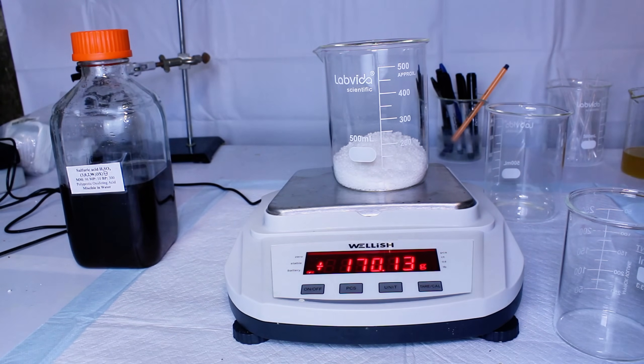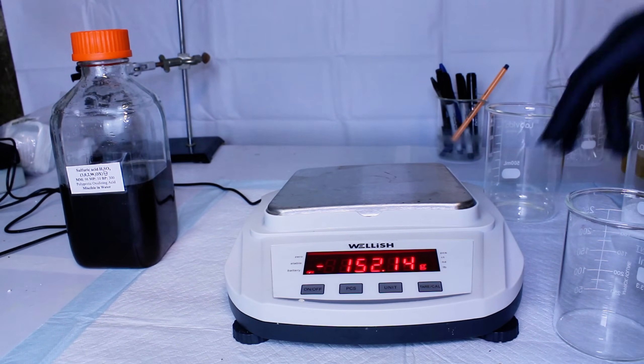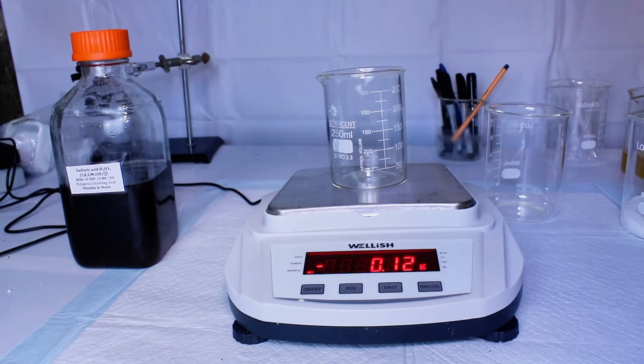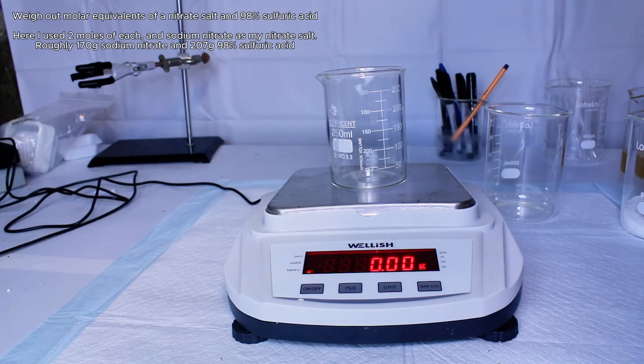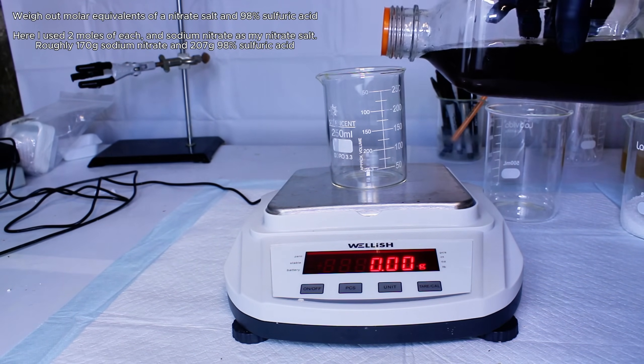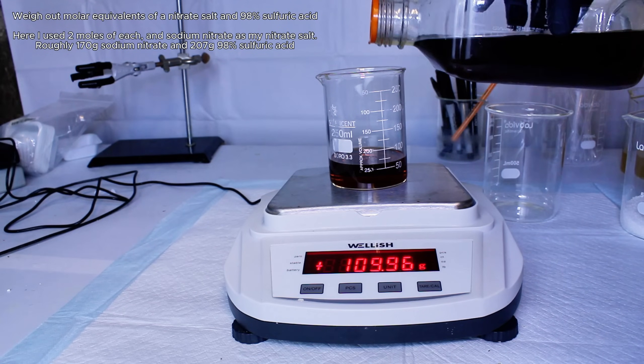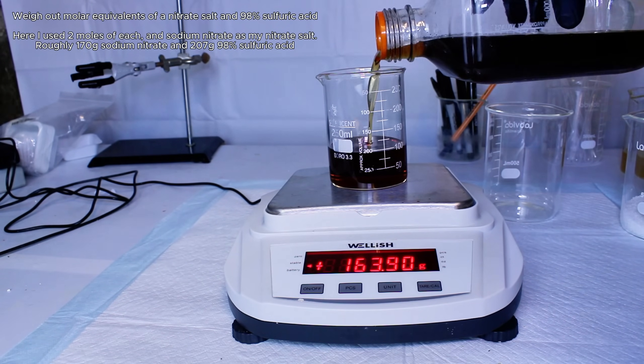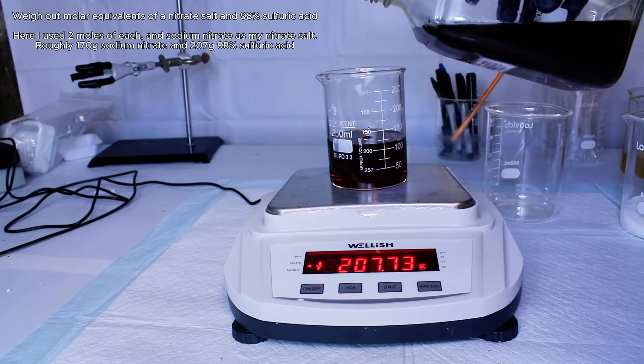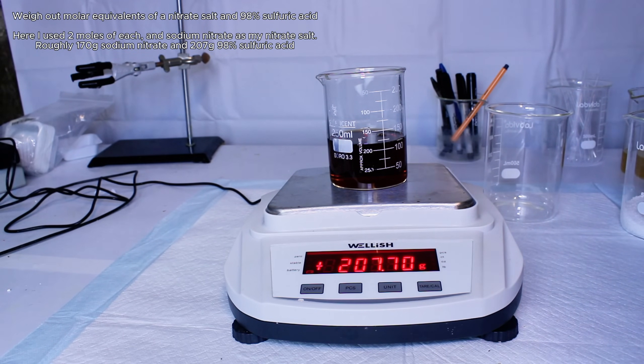To get started, I simply weigh out equal stoichiometries of concentrated 98% sulfuric acid and sodium nitrate. I decide to use two moles of each, which represents 170 grams of sodium nitrate and 207 grams of sulfuric acid, which is in slight excess.